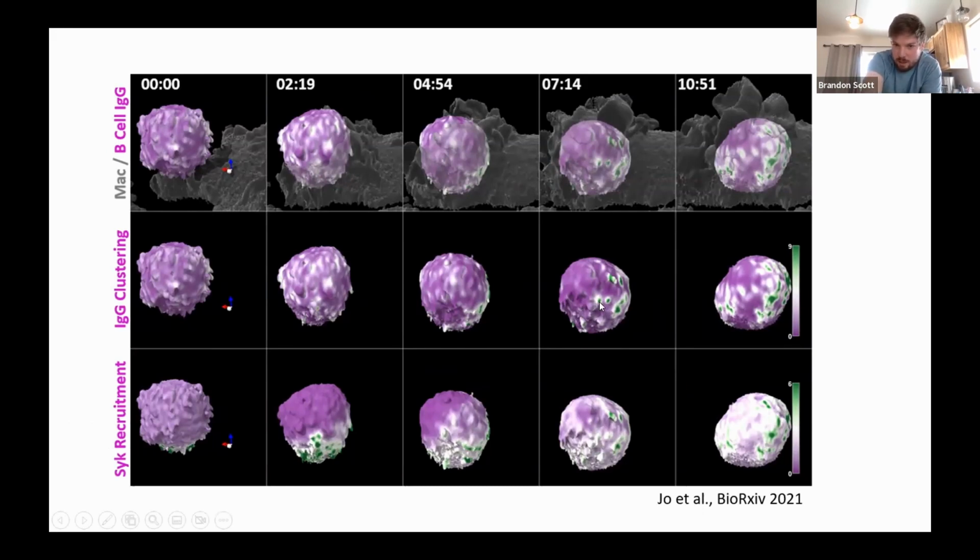Are you trying to say, this spot here, what does its intensity look like over time? Well, you can visualize where that goes, but from here to here, where did it go? And so at this point, this is as good as we can do right now, and is an open area for some improvement by others, I would say.